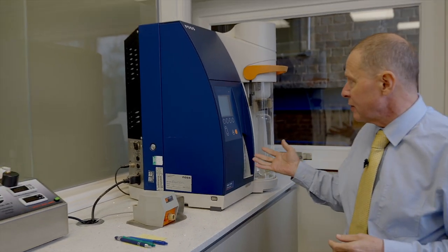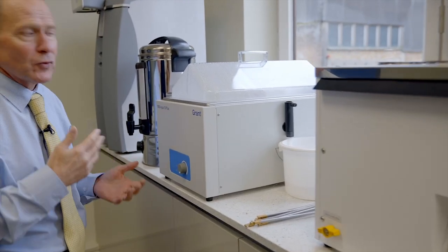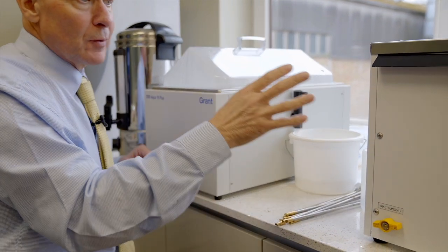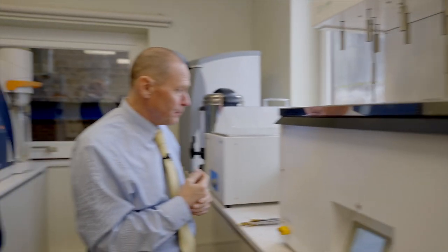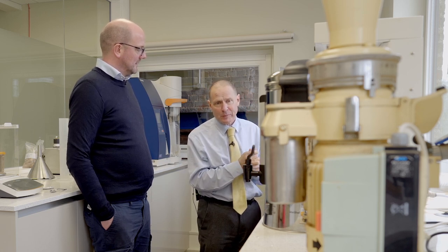This is just a steam distillation unit, used for testing the nitrogen in the barley coming in. And then over this side is more the malt side — this is a water bath. You put samples in here and boil them up for an hour. This is a mashing bath where we can analyse the malts different ways. The EBC method changes temperature, so this can be set to change temperatures halfway through the process. We analyse three different ways: IOB — Institute of Brewers; EBC — the European Brewing Commission; and ASBC — the American Society of Brewing Chemists. We can analyse each way depending on the customer, so we can satisfy their needs without them having to do too much work converting figures.